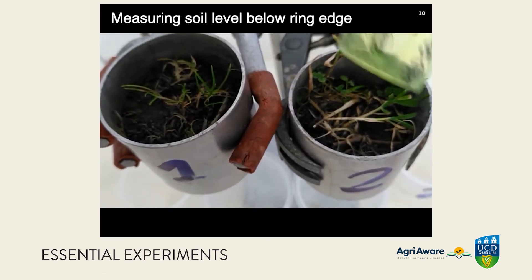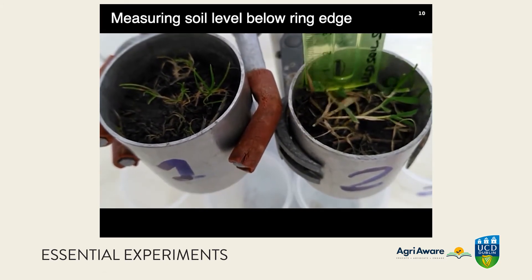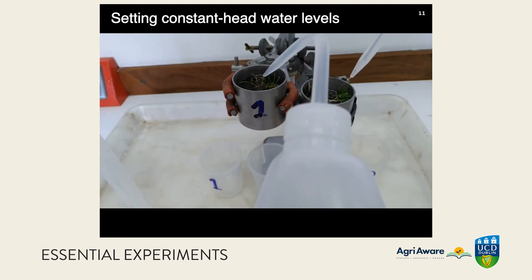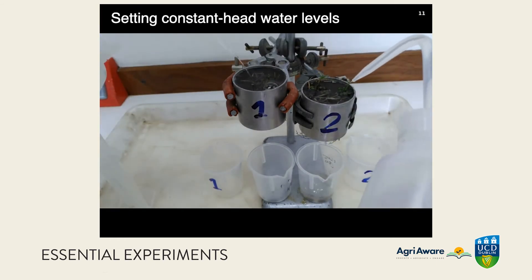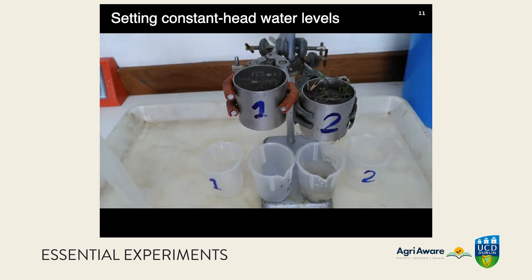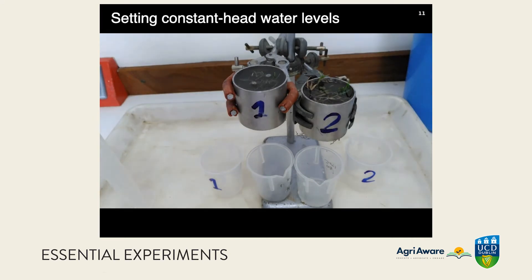The water level should be set level with the top edge of the ring, which is quite tricky to do. We need to saturate the soil and get the water flowing steadily through the ring. You can see it coming out the bottom of both rings, but there is a very much faster flow rate in ring two — we can already see that.